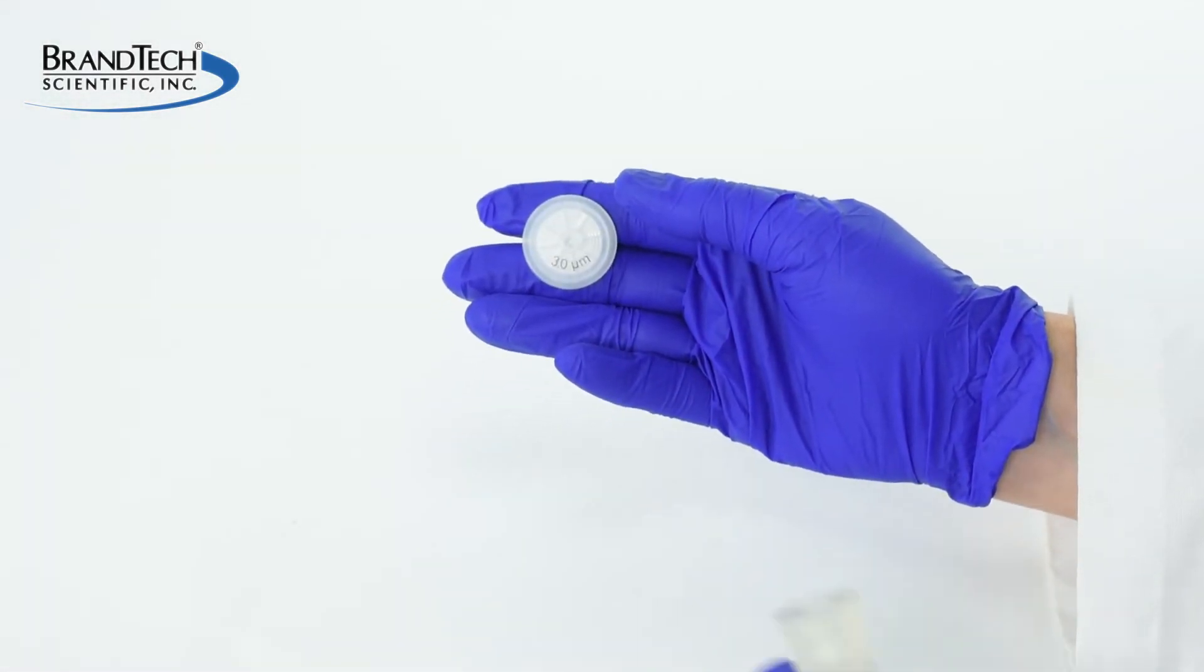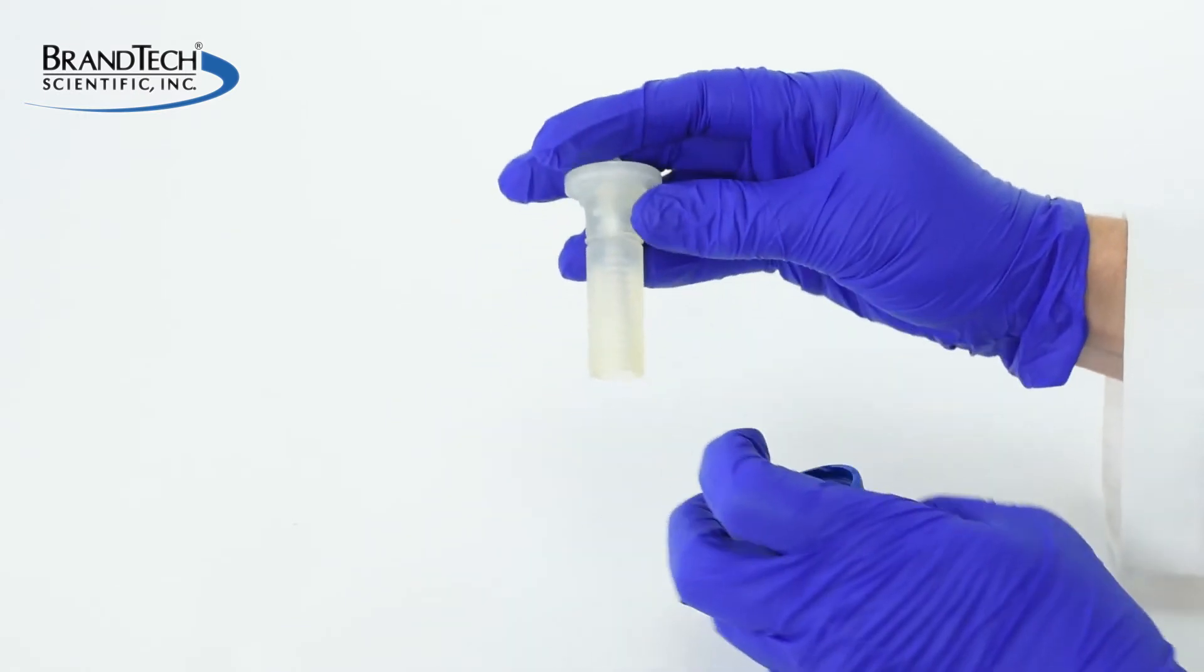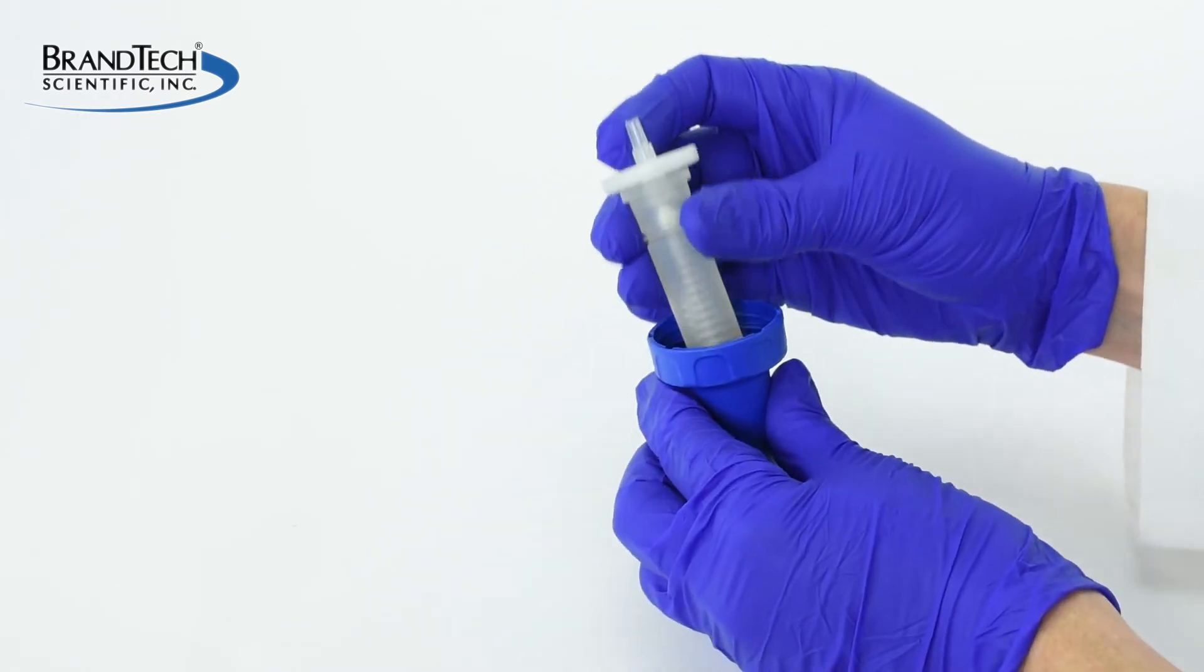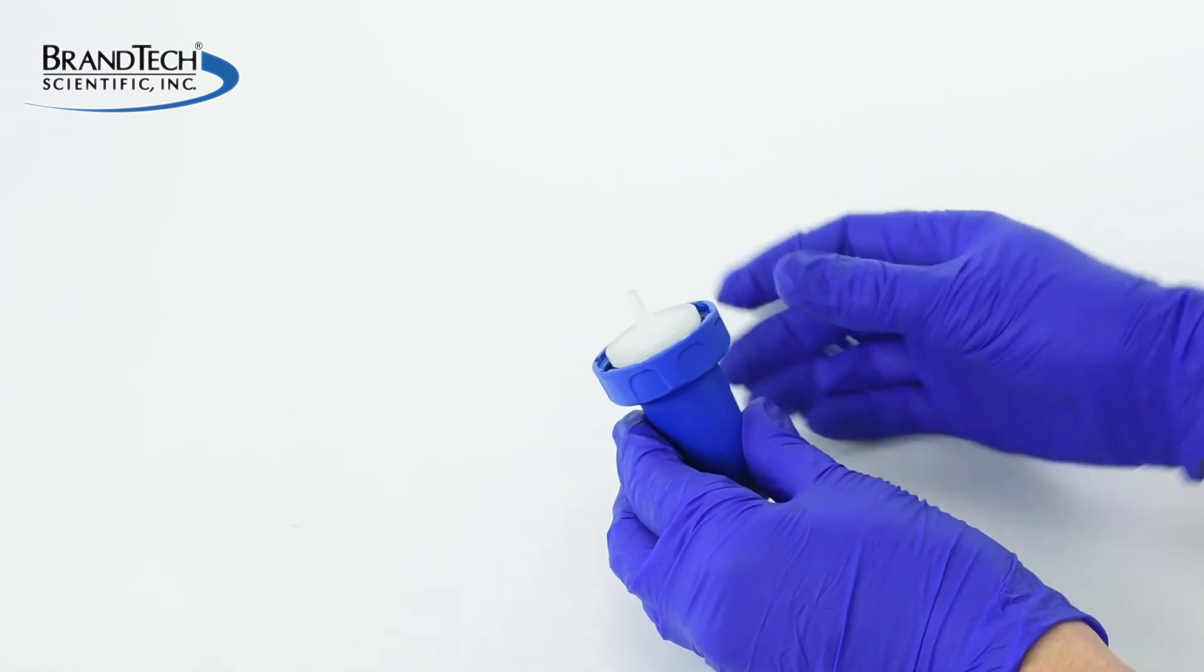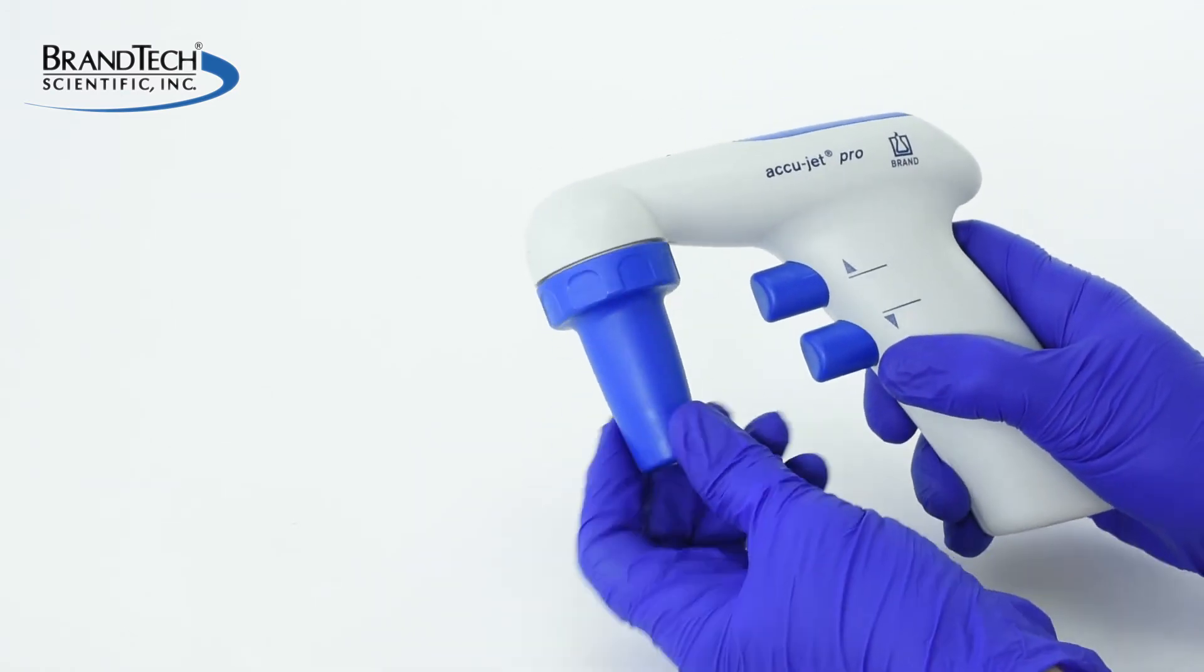To install your filter, grasp the filter and push the wider fitting into the silicone adapter. The thinner fitting should be visible. Then insert the silicone adapter into the adapter holder and screw it into the body of the AccuJet.